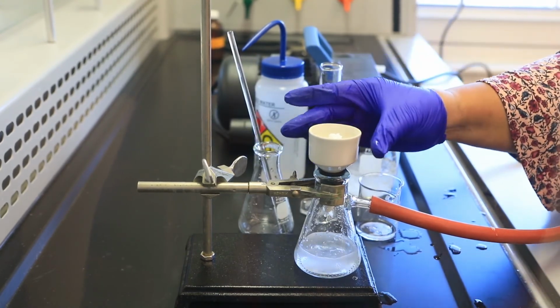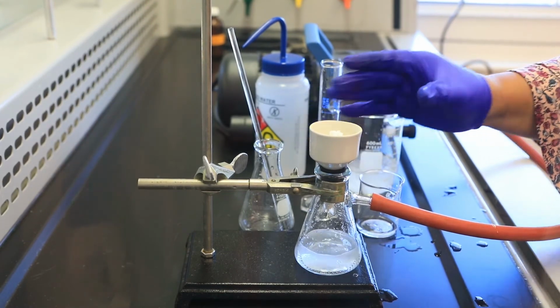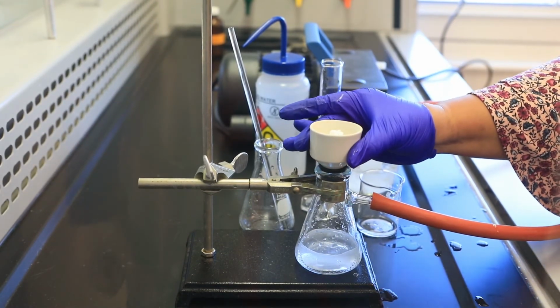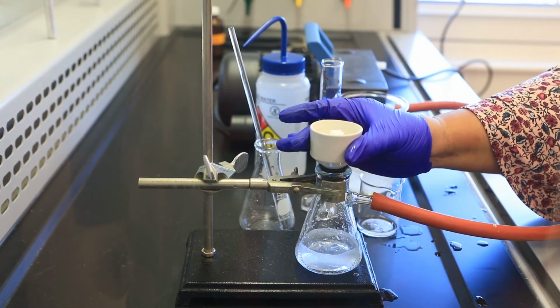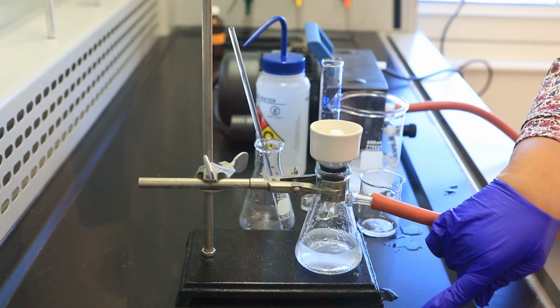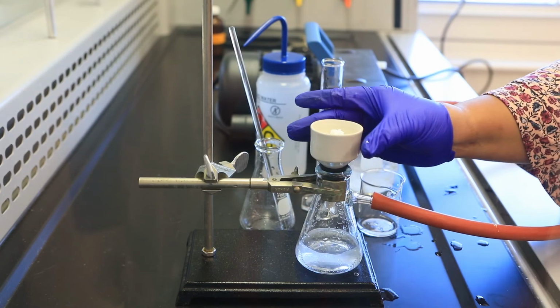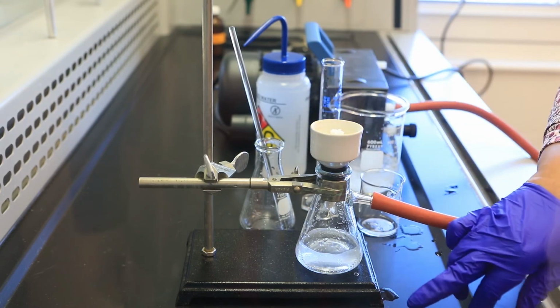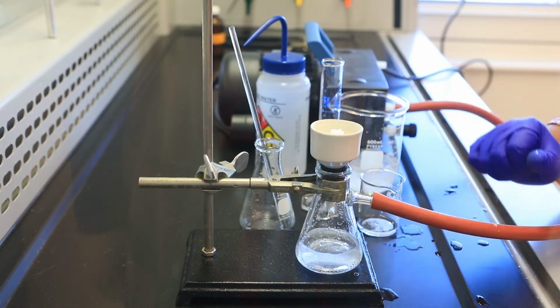I'm going to go ahead and allow the vacuum to pump on our solid for a few minutes, maybe about 5 minutes or so, to aid in the drying process. After that, I'm going to transfer the filter paper and the solid to the watch glass and then reweigh. That second mass will actually be the mass of the filter paper, the watch glass, and our crystals.